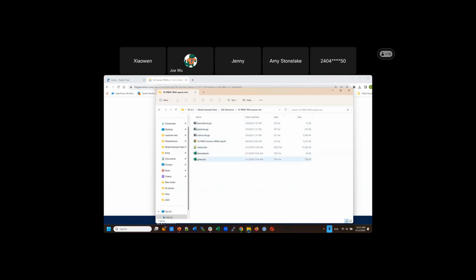So 3 files per sample. This has exactly the same information as the filtered feature barcode matrix H5 file, but this will be much bigger than the H5 file. I would highly recommend you get the H5 file, but we also support importing this 3 file format.